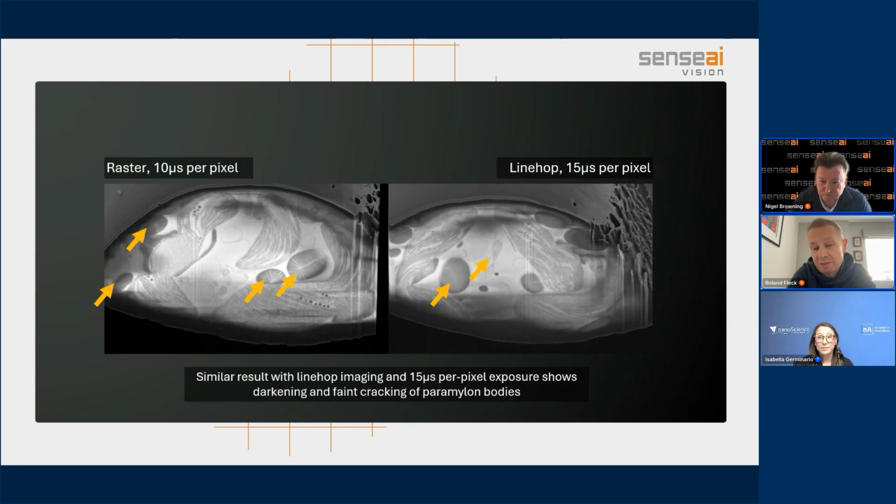Most of the focus of the last two or three years has been Marina's work on the cryo volume imaging, where we've really worked extensively with Nigel and the guys in Liverpool to try and improve our signal to noise. These are vitrified samples. There's no metal contrasting in them. They're really beam sensitive. So we've done an awful lot of work in this area to allow us to work robustly and stably for extended periods of time.